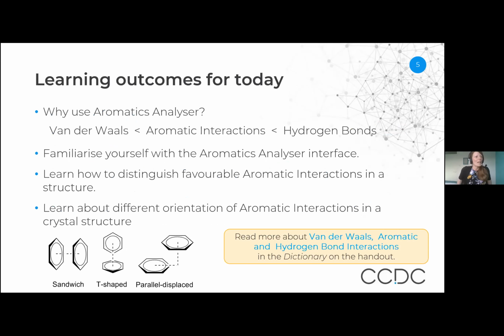So what do we want to learn today? Why you'd want to use the Aromatics Analyser, familiarity with the Aromatics Analyser interface, how to distinguish favourable aromatic interactions in a structure, and about different orientations of aromatic interactions in a crystal structure. You can read more about some of these terms in the dictionary at the end of the handout.